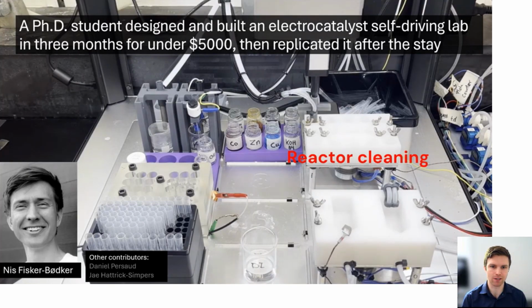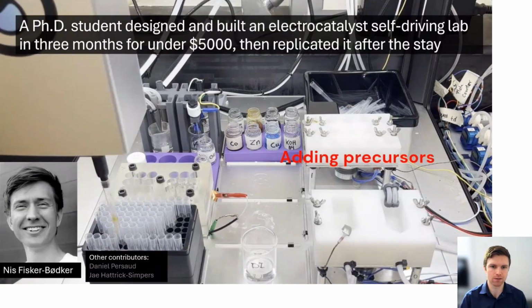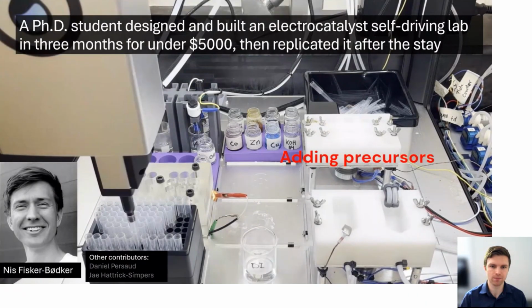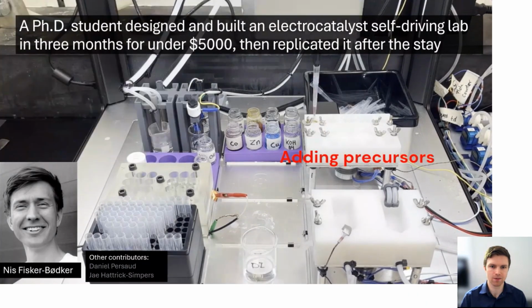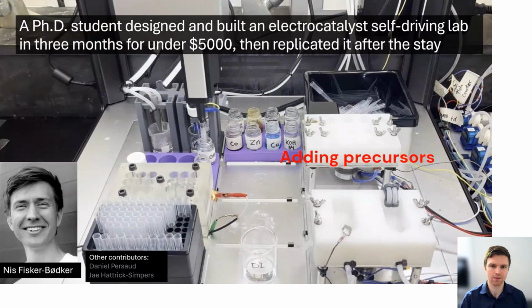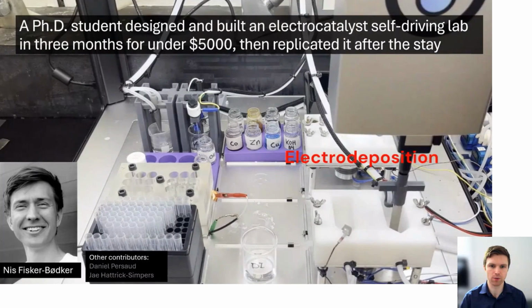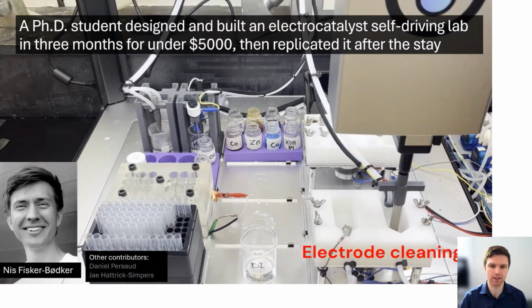So it's picking up different tooling. It's adding these metal precursors. It's grabbing a tool, the electrode, for doing electrode deposition, and then cleaning the electrode, and then carries this out iteratively in a loop.